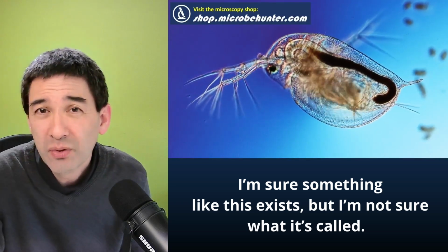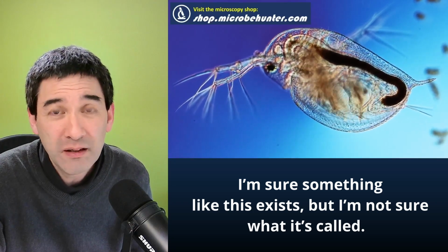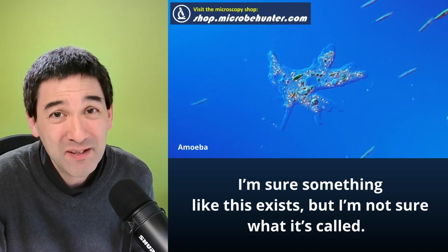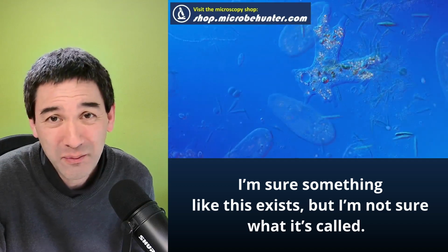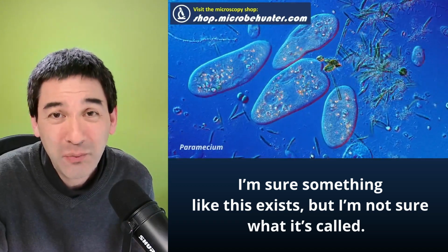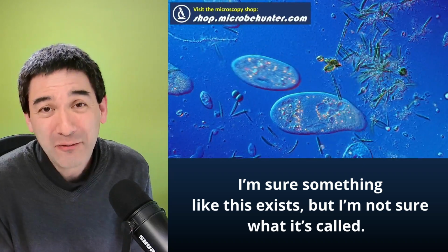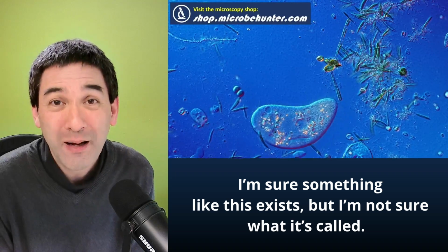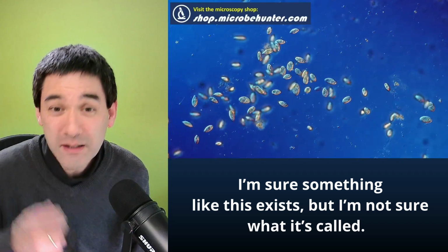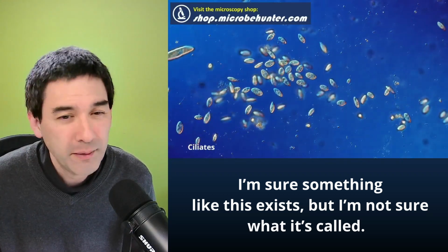Because if you really want to exclude the possibility of air between the objective and the slide, then you have to completely seal everything off airtight. And don't forget one thing: the same thing would happen as in the case of electron microscopes. If you place a moist sample that contains water into a vacuum, then the water is immediately going to evaporate. It's going to essentially boil away. So this means that you have to use specimens that are either completely dry or mounted in permanently mounted slides, right?